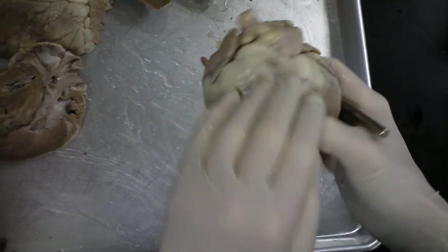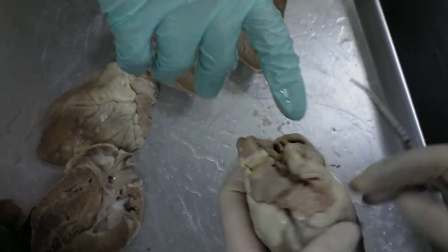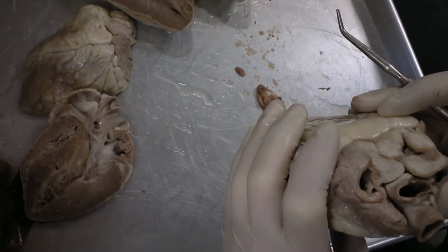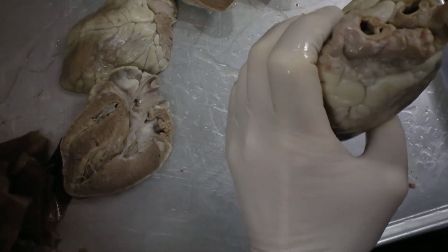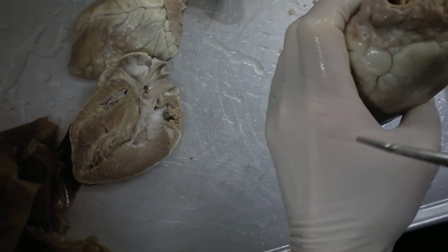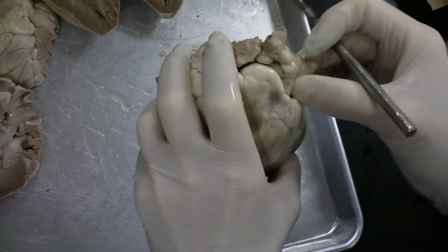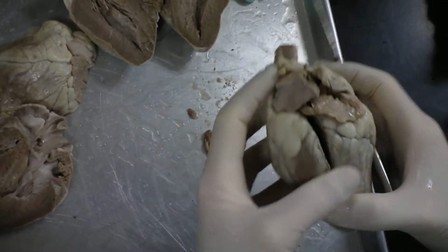You have two holes, so is it like a 50-50 chance, it just goes out one of them? Or is it just the branching? Oh, it's the branching. We have branching in us, subclavian. But in a sheep, the branching is so soon that when they cut, you see a branch. But in a human, the pulmonary trunk looks like one lumen.